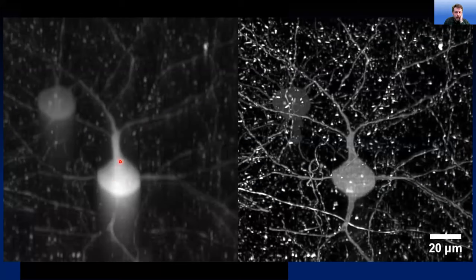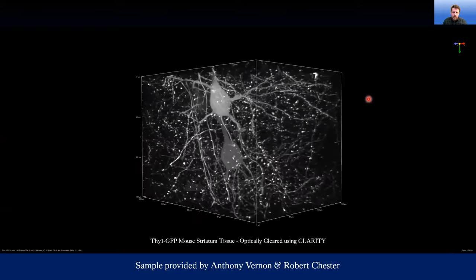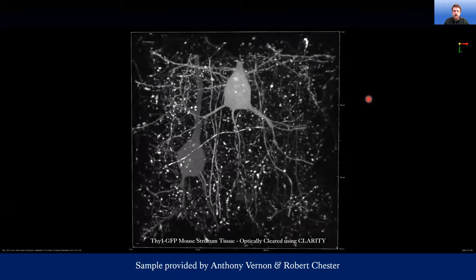The view that you've got here again is an X and Z projection, so that you can see it from the side on, and you can see the effect of this Airy pattern causing what I like to call Z smudge, but it isn't really, it is actually patterned. When you deconvolve this, it will then get rid of that effect, and you can see it faithfully reconstructs the biological information underneath. What does that look like when you look at it in 3D?